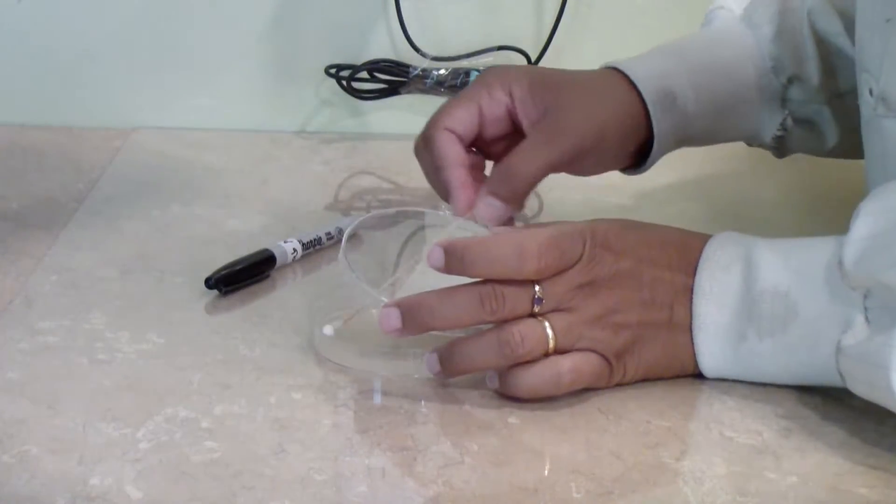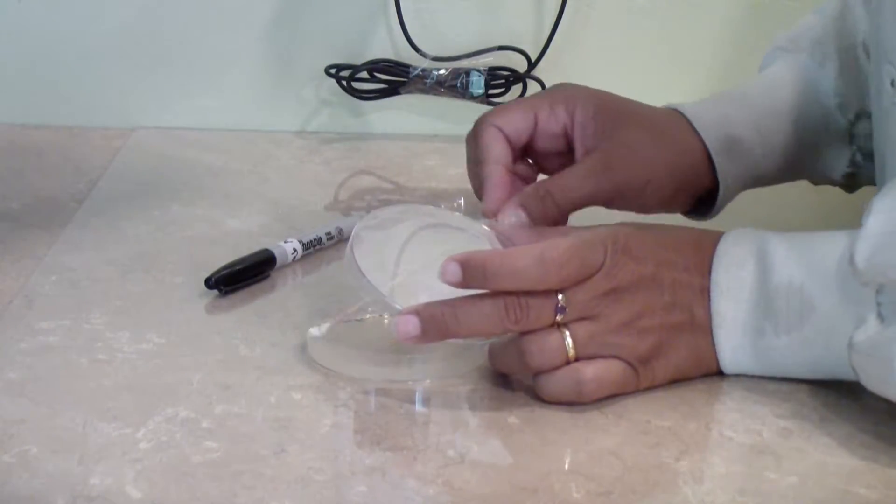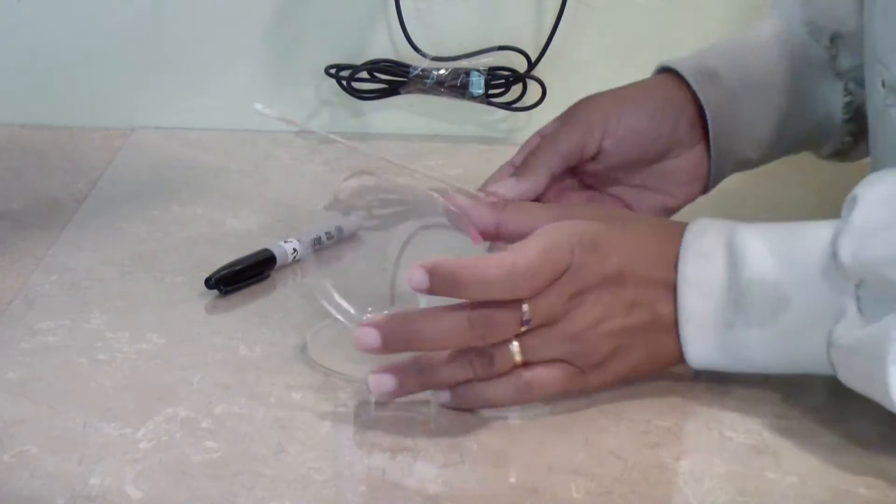Then rub the cotton swab over the surface of the TSA agar. Turn the plate over so you can reach all areas of the medium.